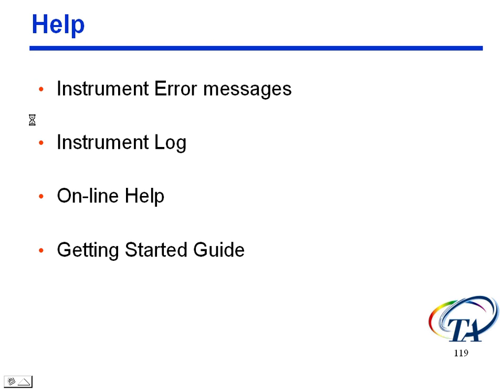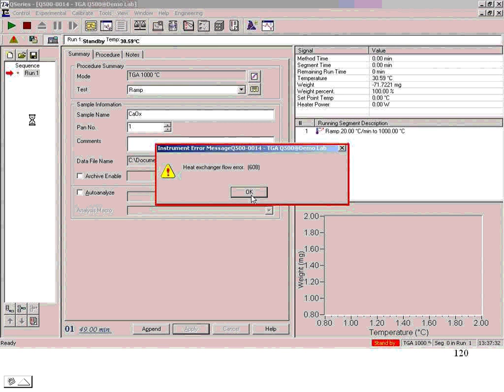Now this is an instrument error message. It popped up when I tried to start a run without a heat exchanger being plugged in, so it's got a heat exchanger flow error.